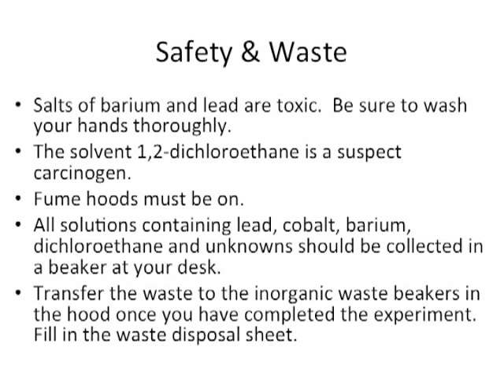All solutions containing lead, cobalt, barium, dichloroethane, and your unknowns should be collected in a beaker at your desk. Transfer the waste to the inorganic waste beaker in the hood once you have completed the experiment. Fill in the appropriate waste disposal sheet.